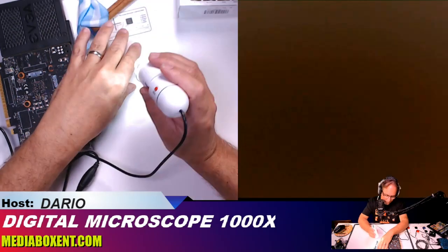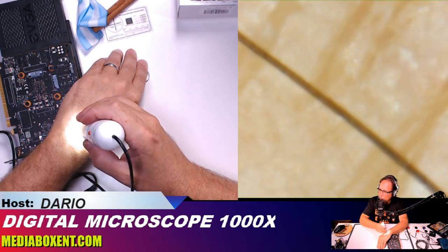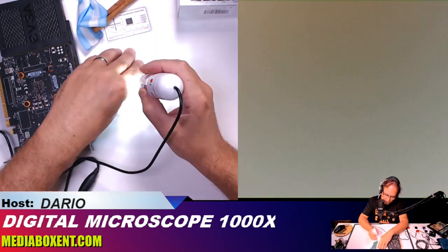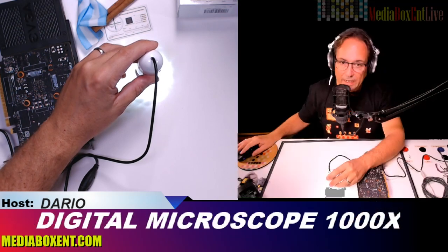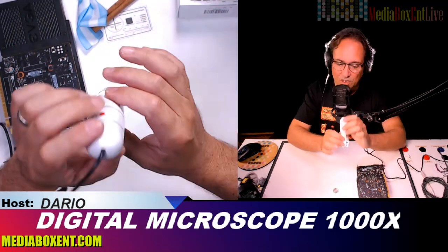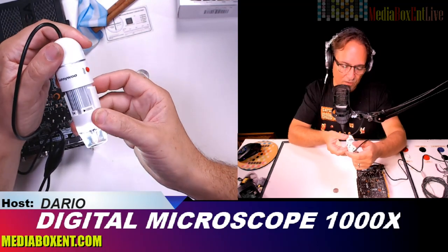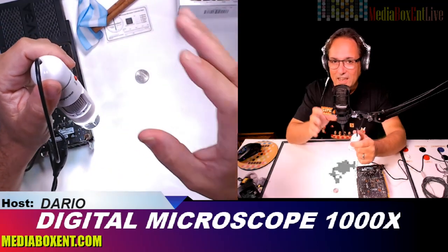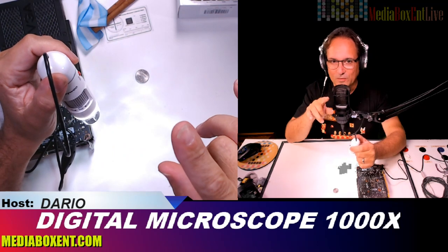Now we're going to change it — if you want to see my skin we could do that too, but we're going to move on to the software section. Remember, all the information and a link to get this product is below this video. This is also a great gift for kids, especially with Christmas coming — they can do a lot of little experiments with it.